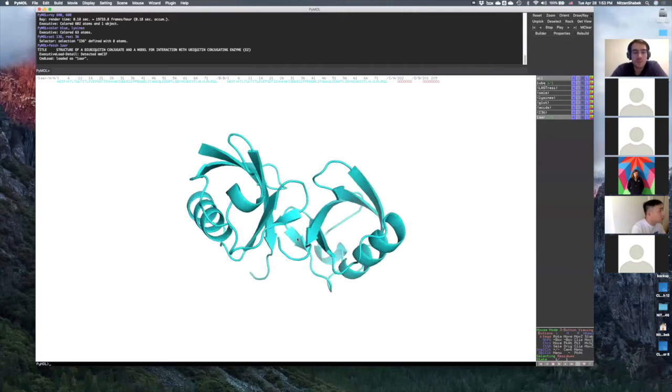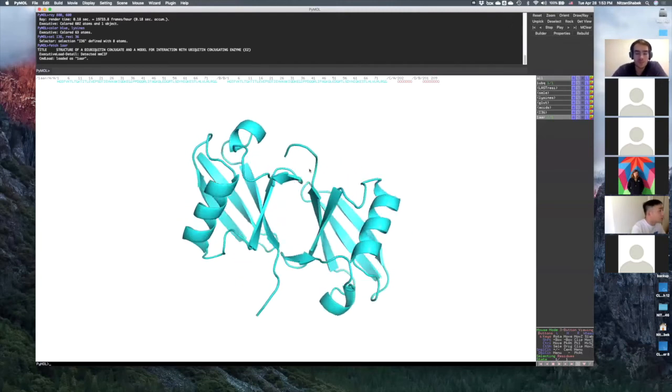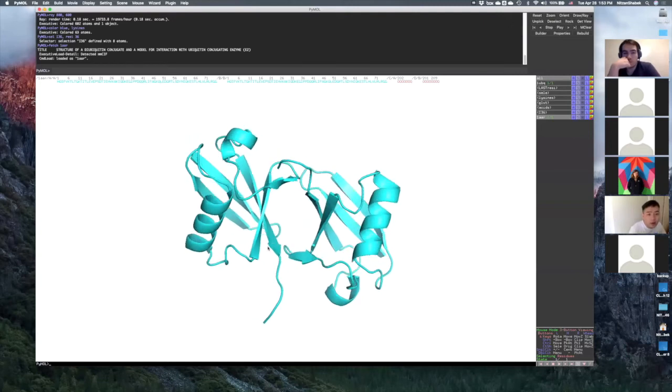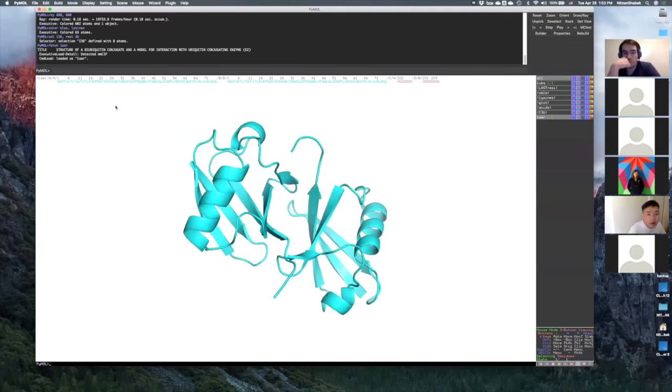Now, let's try to do one more investigation only on this structure. So this structure recapitulates a really, really important polyubiquitin. It's not polyubiquitin, it's actually diubiquitin chain, but this is the first two ubiquitin chains that happen. And if you remember, what happened here is that ubiquitin covalently bound to the other ubiquitin by forming an isopeptide bond with an epsilon group of lysine, okay? So I said lots of stuff now, right?